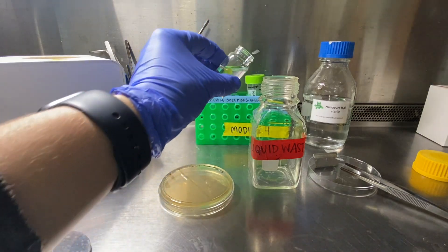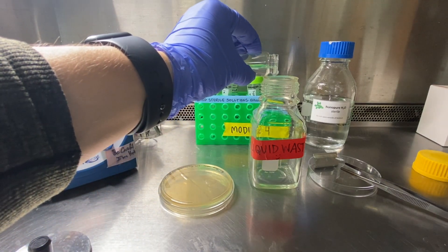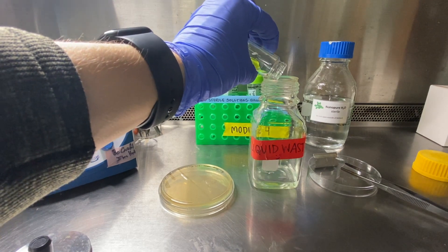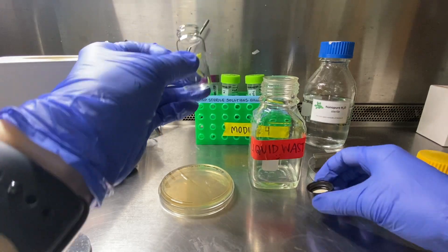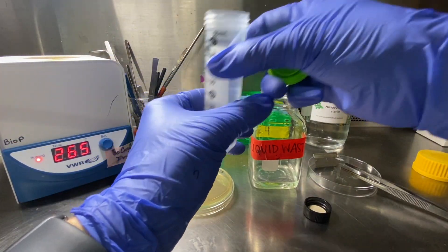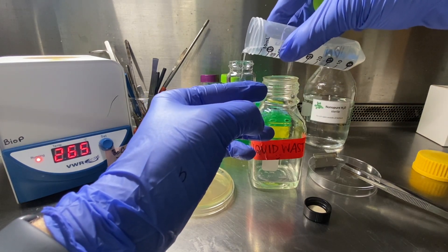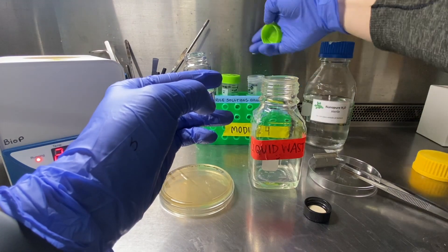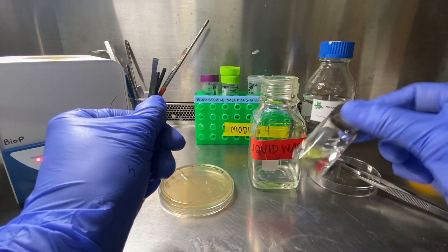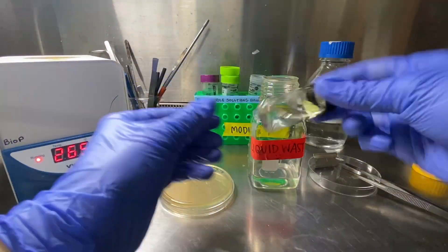Go ahead and pour off the sterilization solution, taking care to keep the leaf in the glass vial itself. Then take your nano-pure water — I prefer to use the water in the 50 ml conical tube, as it's easier to pour — and refill the glass vial with nano-pure water. Replace the cap, invert, and you'll do that washing step three times with nano-pure water.